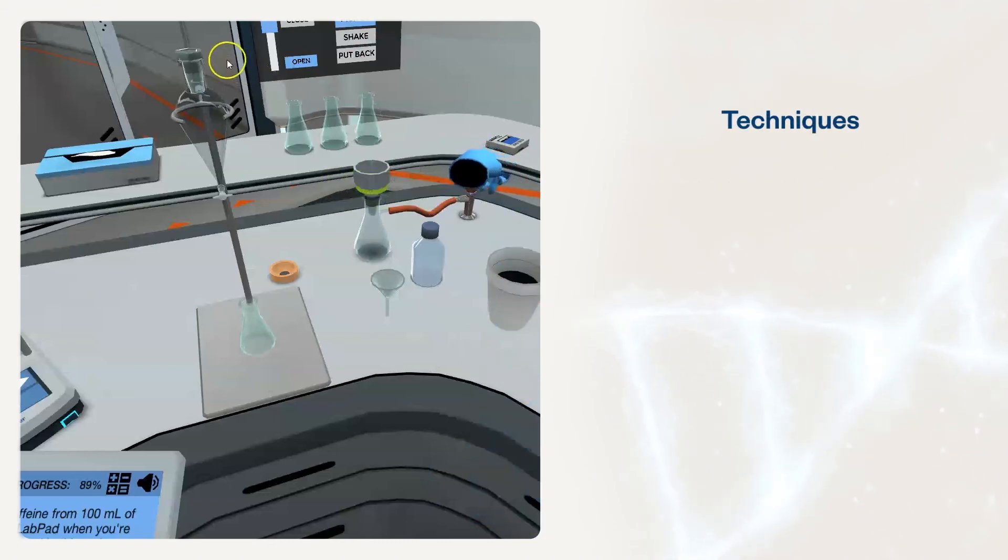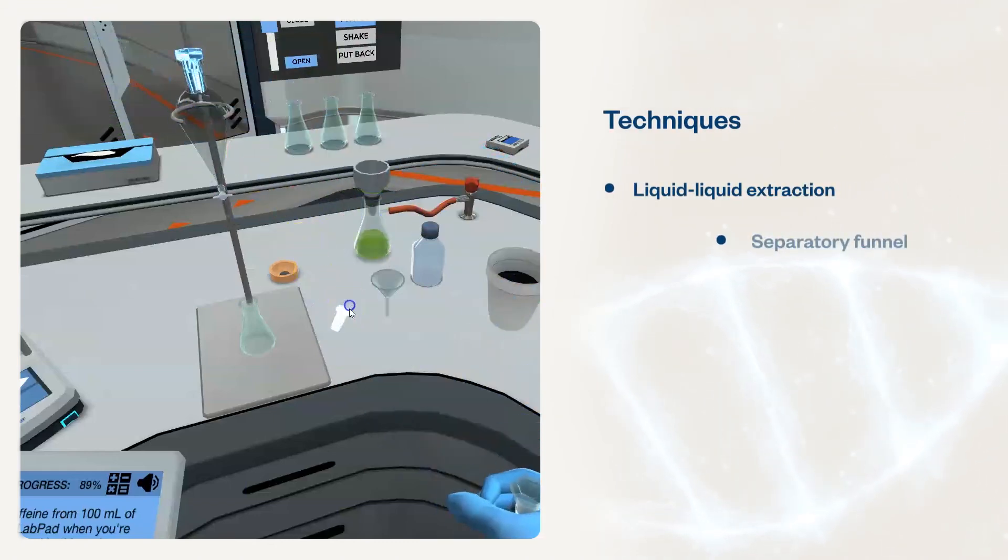Students will use techniques such as liquid-liquid extraction and separatory funnel.